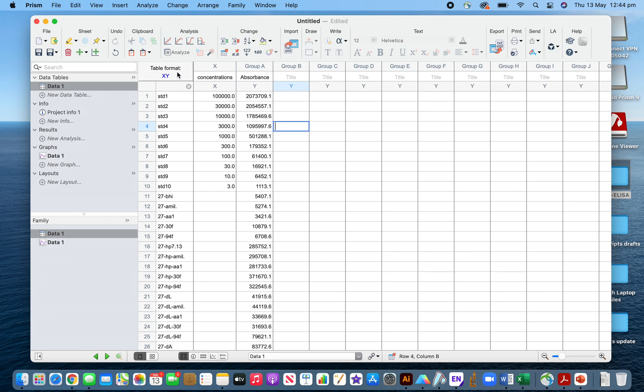At first I have calculated the absorbance in the Excel sheet, and then I copied the values from the Excel sheet to GraphPad Prism. This is Prism 9.